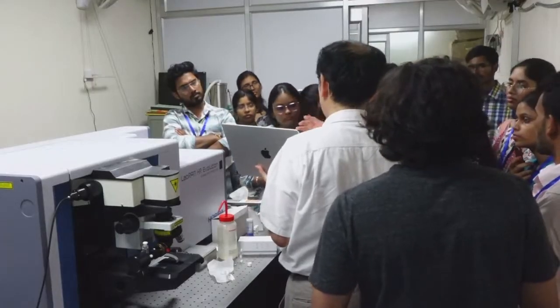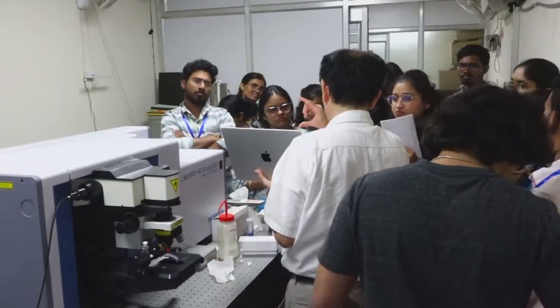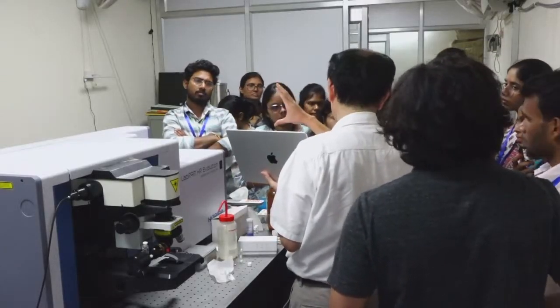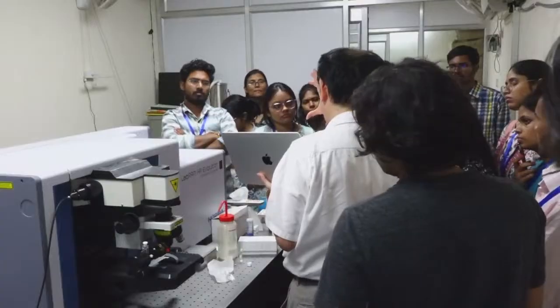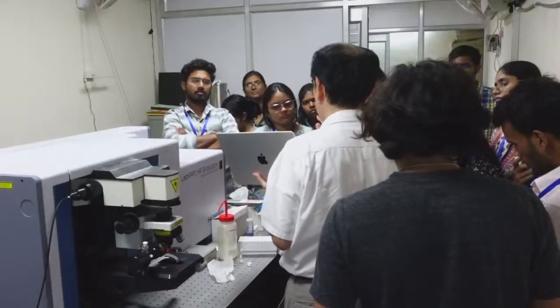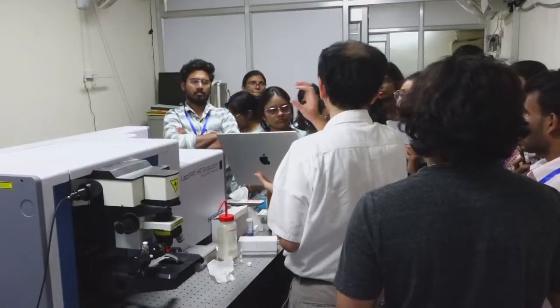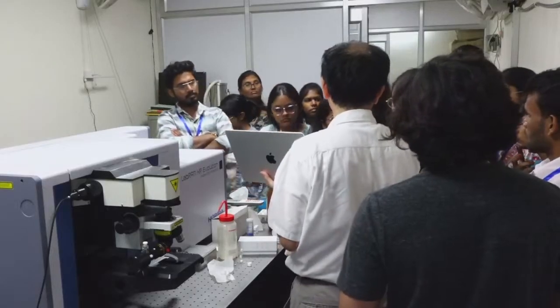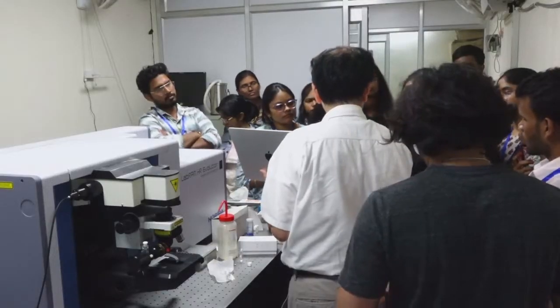My explanation is about the exposure time and accumulation number. If you set the exposure time short and increase the accumulation number, then the AD conversion noise increases. So instead, you should set a longer exposure time and correspondingly smaller accumulation number. It's better. But if you have time, longer exposure time and increased accumulation number is the best. Increasing both is the best if you have time. It depends on the sample as well. These two parameters will also be affected by the type of sample.